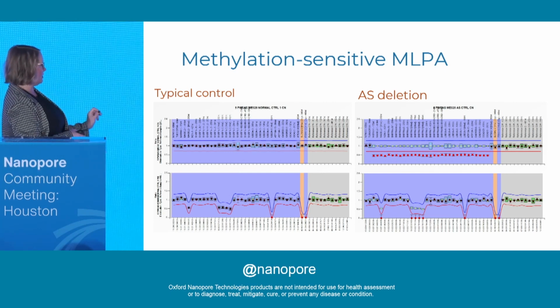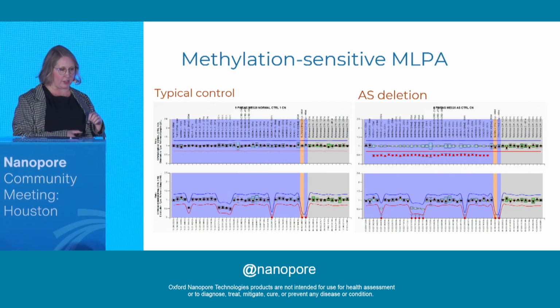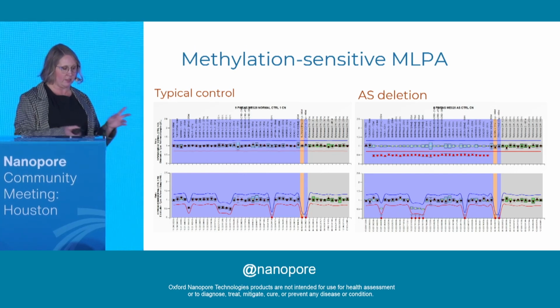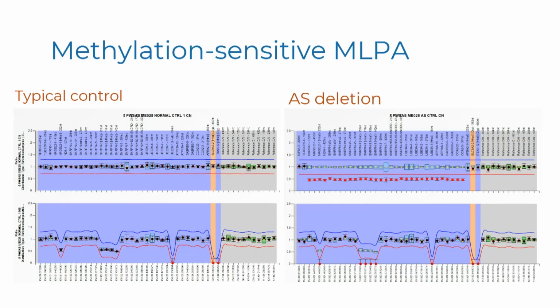And then the trick here is that we are including a restriction enzyme that cannot cut the methylated. When it overlaps the restriction site where it's methylated, it's not cut. And so we have 5 probes down at the bottom where you can see a reduction. Those black dots are now lower. And so this is indicating that we have one maternally and one paternally derived copy of this material, and when we include that restriction enzyme, we see this decrease in signal.